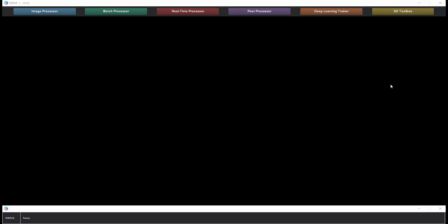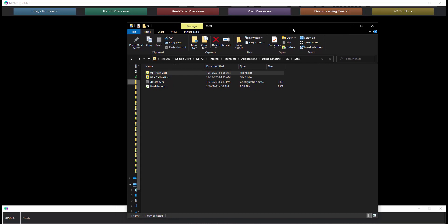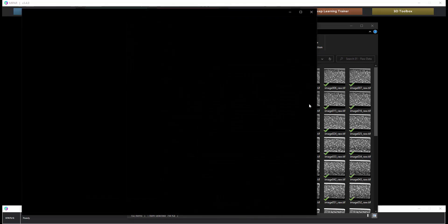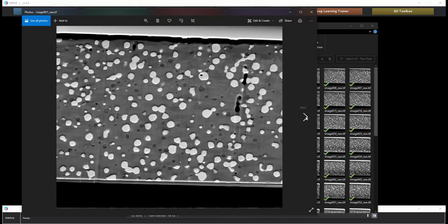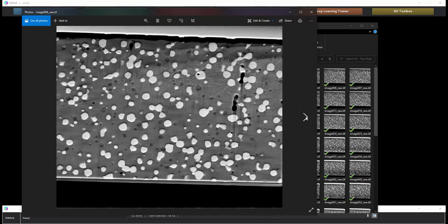Welcome to the MyPAR 3D demo. Here we have a data set in our raw data folder which is a dual beam FIB 3D data set of particles in a steel sample.